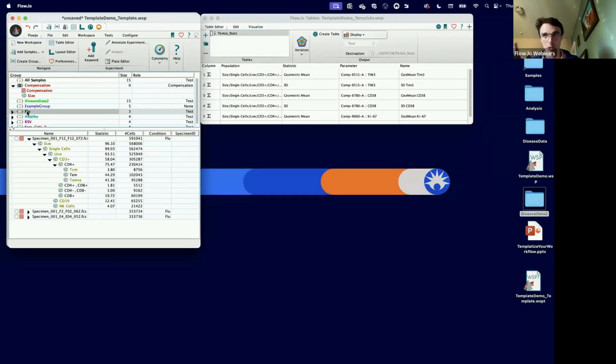There's maybe some discussion to be had about whether or not it's okay to use an old compensation matrix, but I'm just going to do so in this case. It's valid in a lot of cases, or it can work decently.